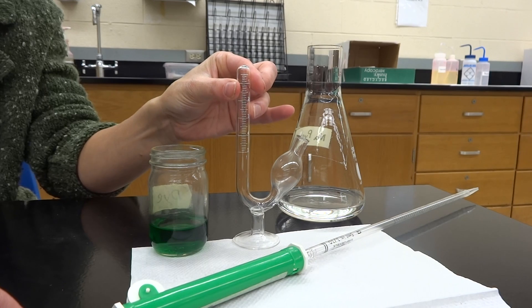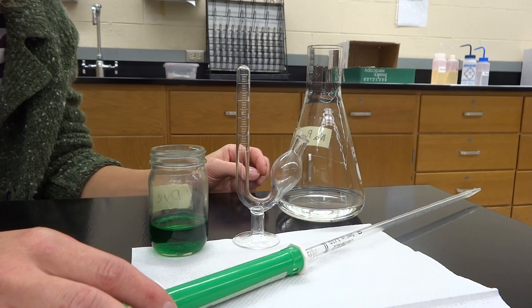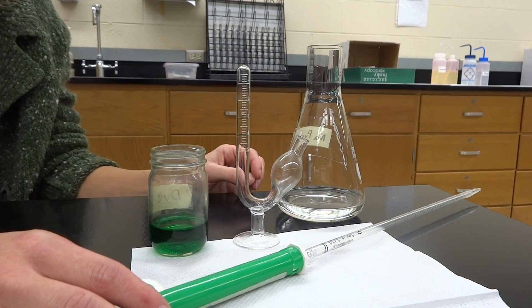So all five of them should look about the same, and then you're going to put the solution that it asks for. We use solutions that are going to be based on sugar, mostly — glucose, lactose, and sucrose.